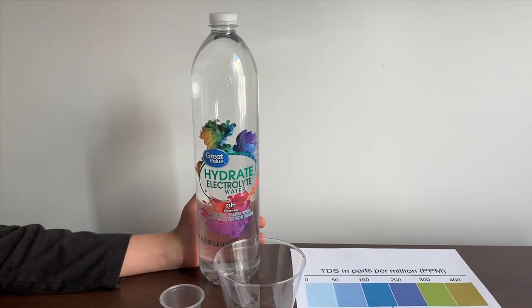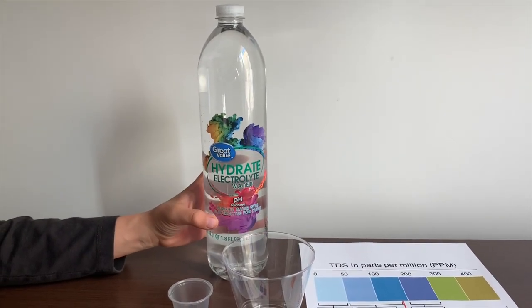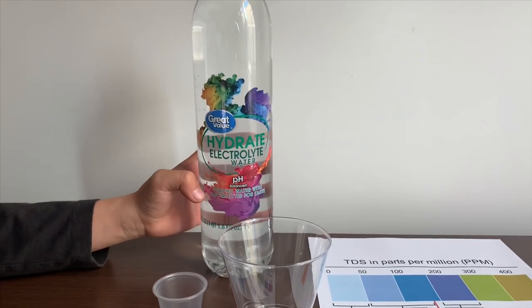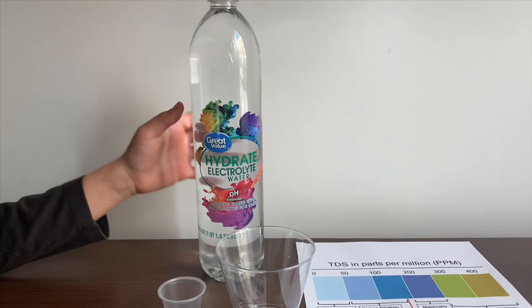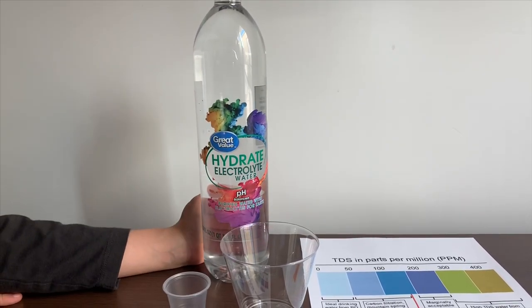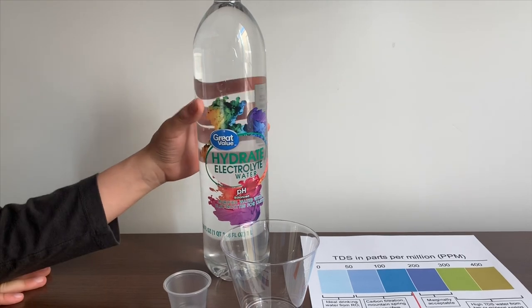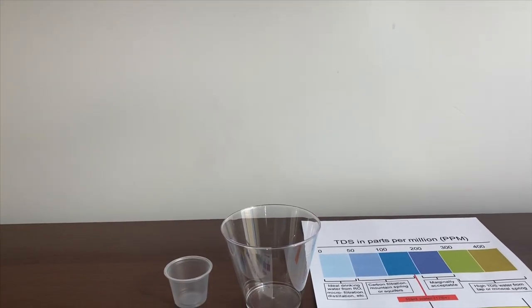This is Great Value electrolyte water — purified water with electrolytes for taste. Remember we tested the alkaline version of this; its TDS was 45 and its pH was 10. This is also sourced from Wisconsin, and let's see how the TDS and pH compare.